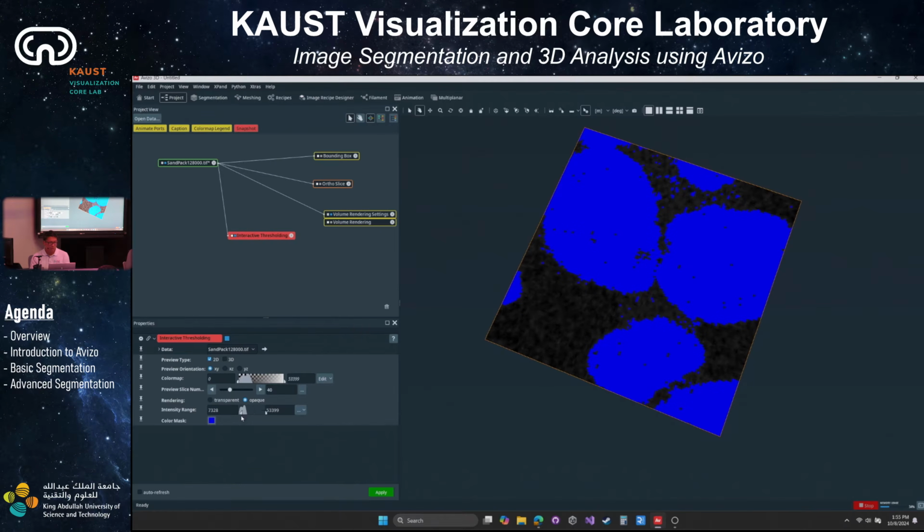So what's thresholding, right? Thresholding is saying I have a minimum and maximum intensity value that I'm interested in. Everything that's between these values, I want to assign a label of 1. Everything else is 0, okay? So the blue ones that I highlighted here will be assigned to 1 if I click apply, and everything else is 0. And you can adjust that parameter here. Of course, if I set this to 0, it will select everything, because everything is between 0 and the maximum.